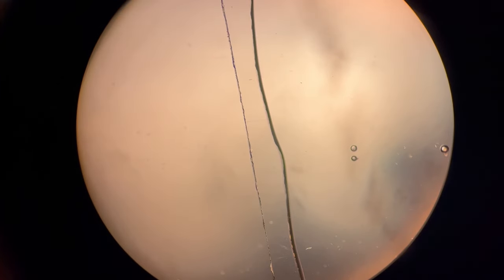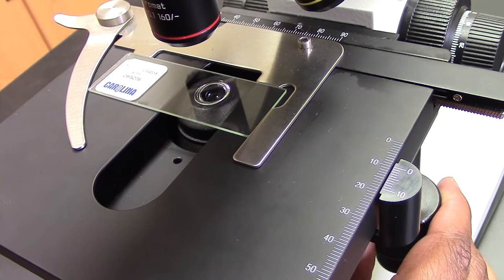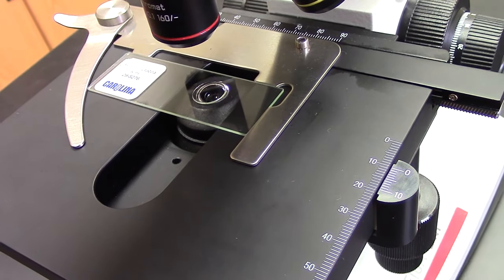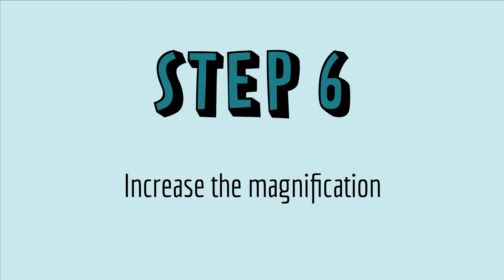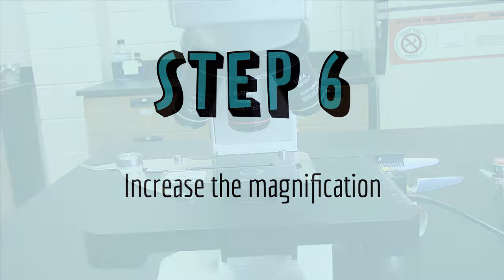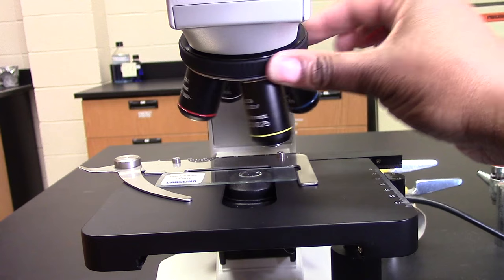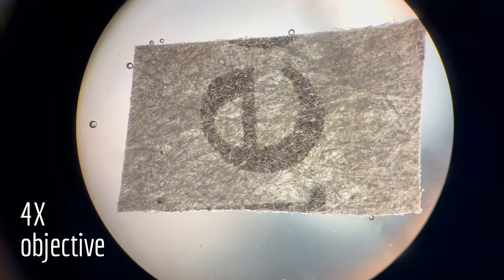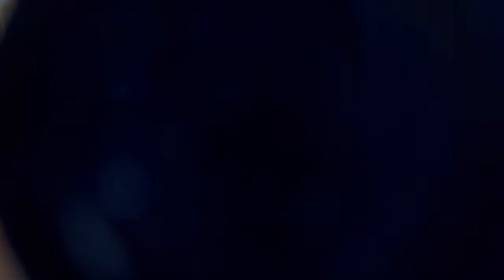Once you focus on the edge of the cover slip, you can use the stage control knob to move the slide over so your sample is under the objective, and now your sample should be close to being in focus. You can increase magnification by rotating the nose piece to the next objective power. It's good practice to increase the magnification one objective at a time — don't skip an objective.